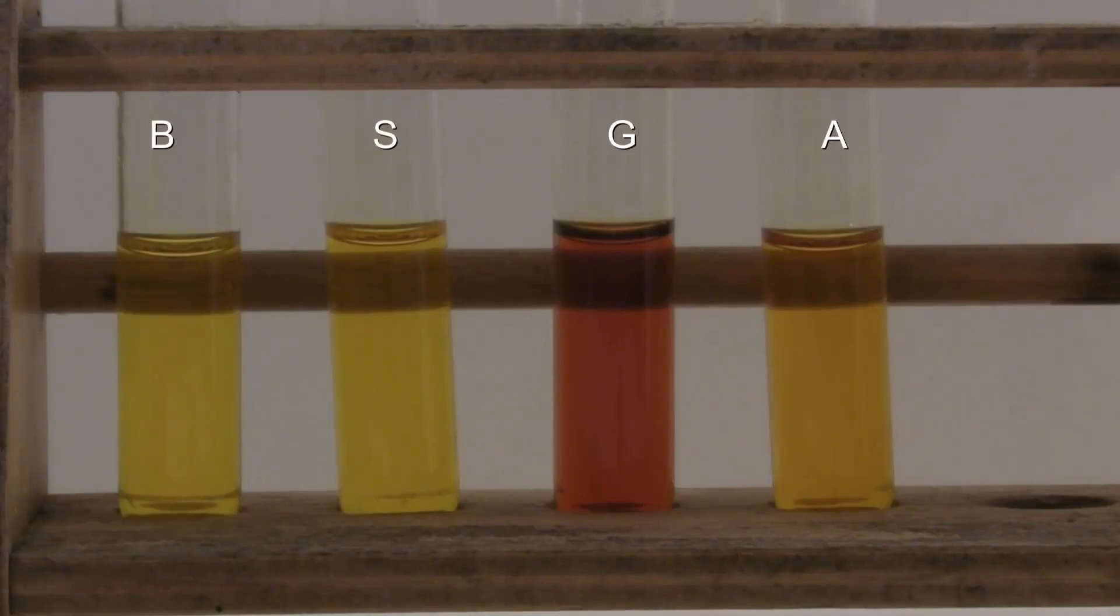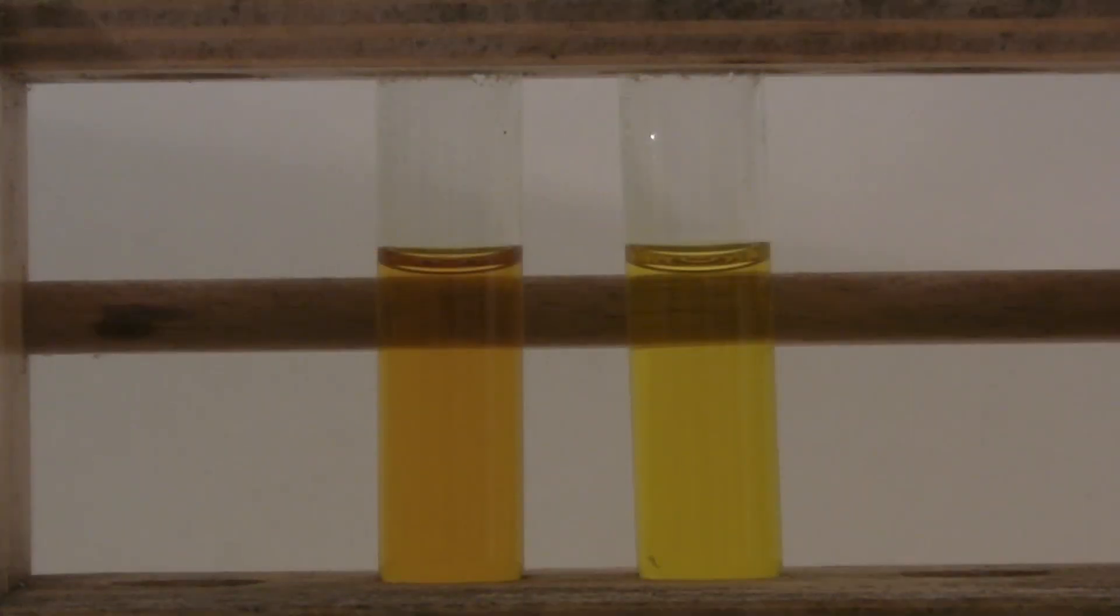The result corresponds to the expectations. The blank and the saccharose didn't react, because the latter is not a reducing sugar. The glucose is a reducing sugar, which is why it has reacted obviously. The acetaldehyde was only present with a low concentration, which is why the color is not as strong. But it can be seen well in comparison to the blank.